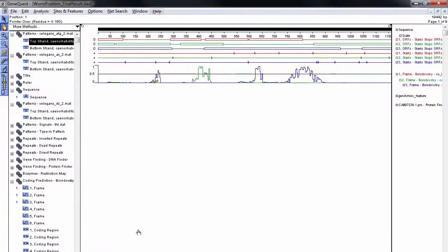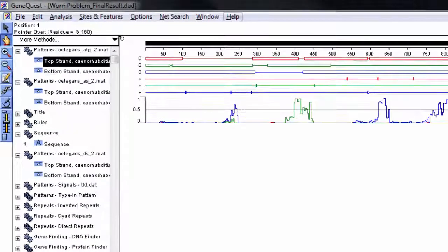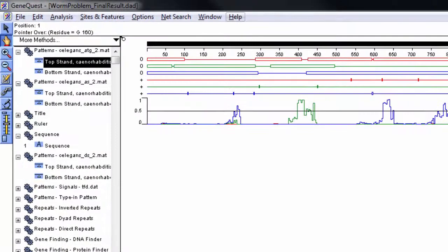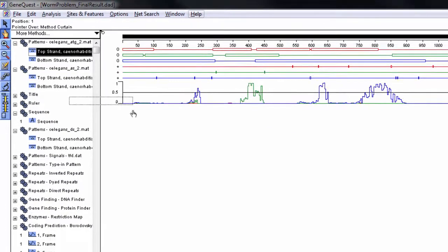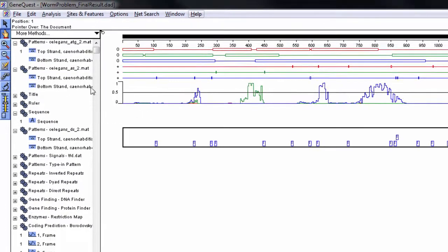This suite also offers easy-to-use sequence editing and annotation, including gene discovery functionality for identifying and annotating coding regions.